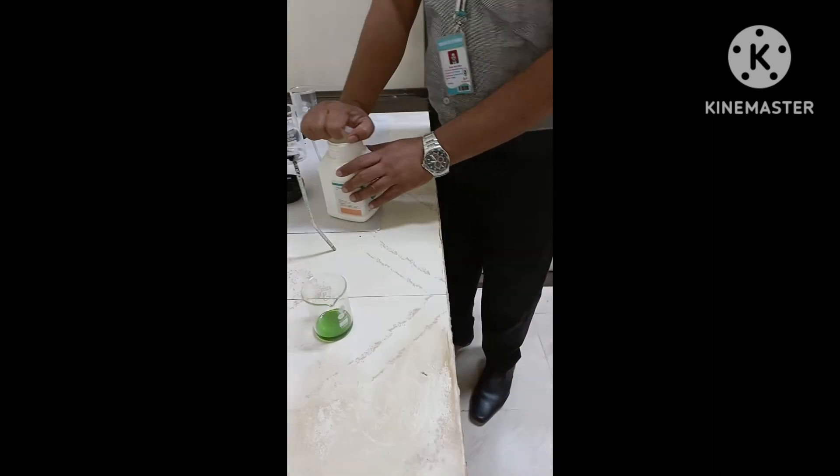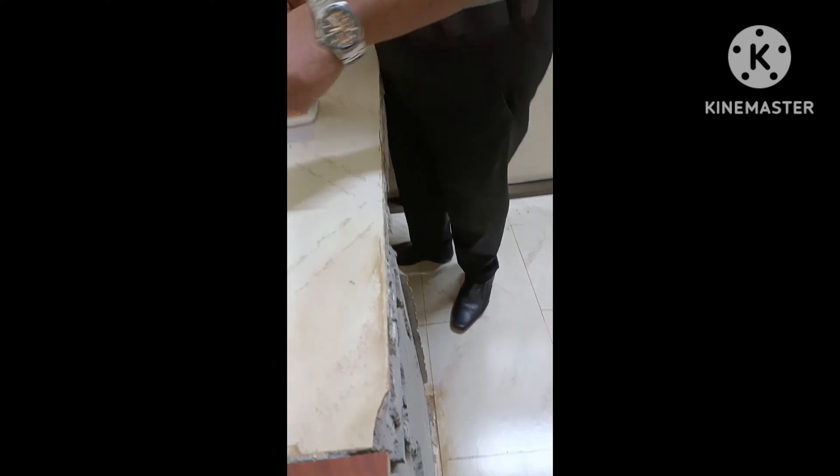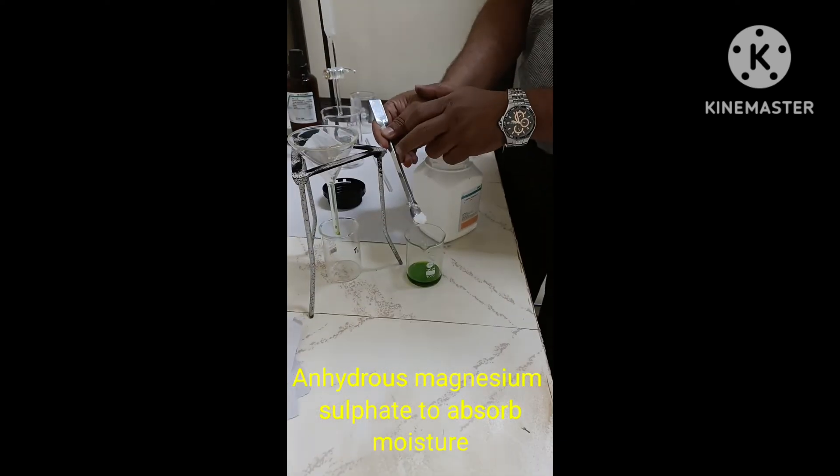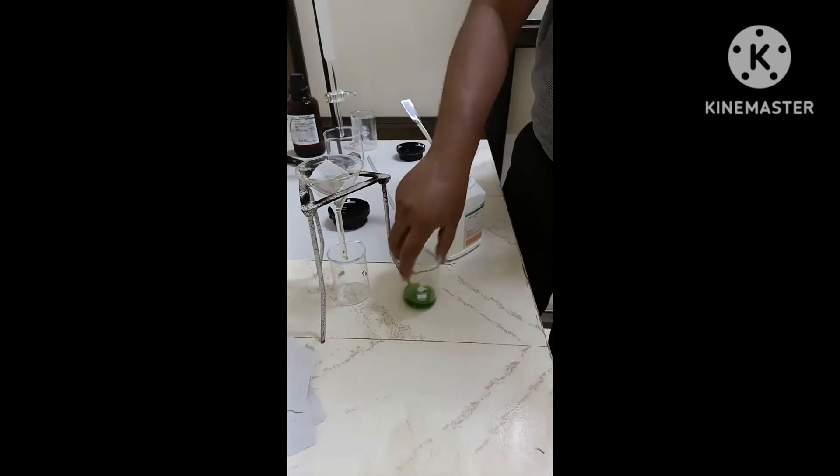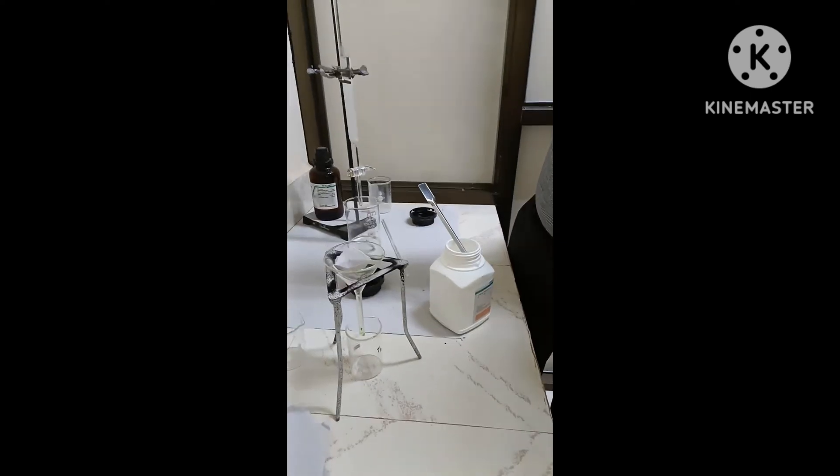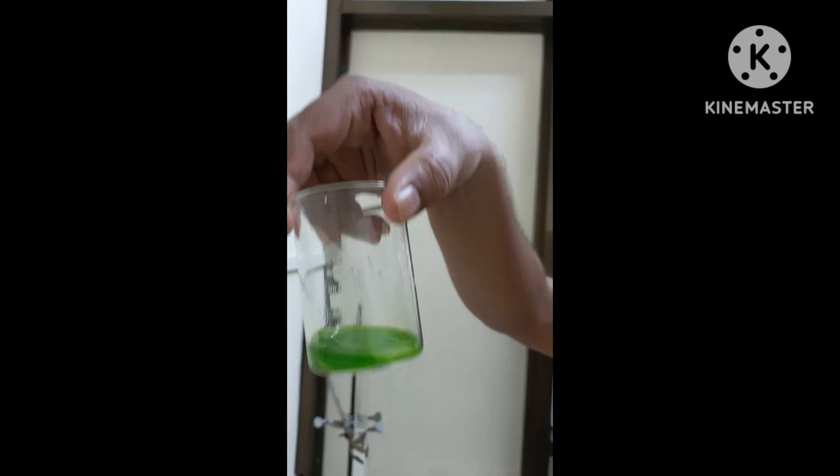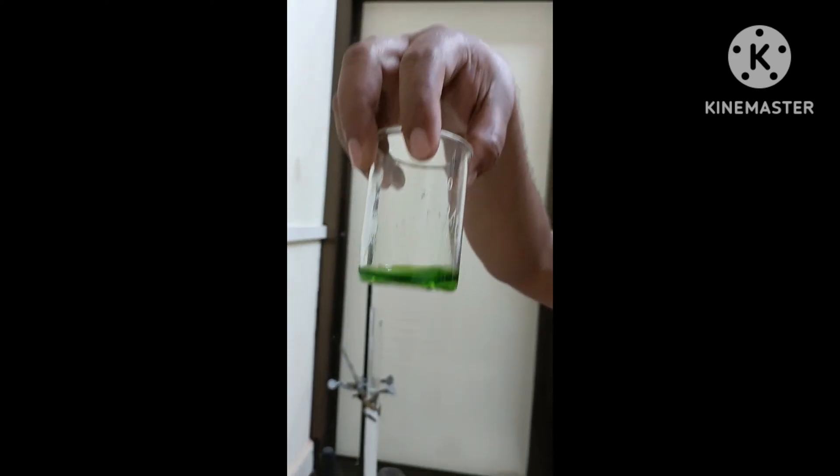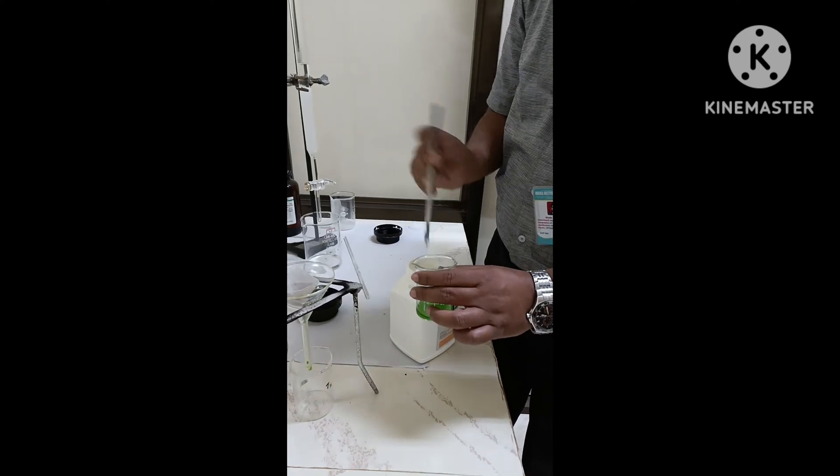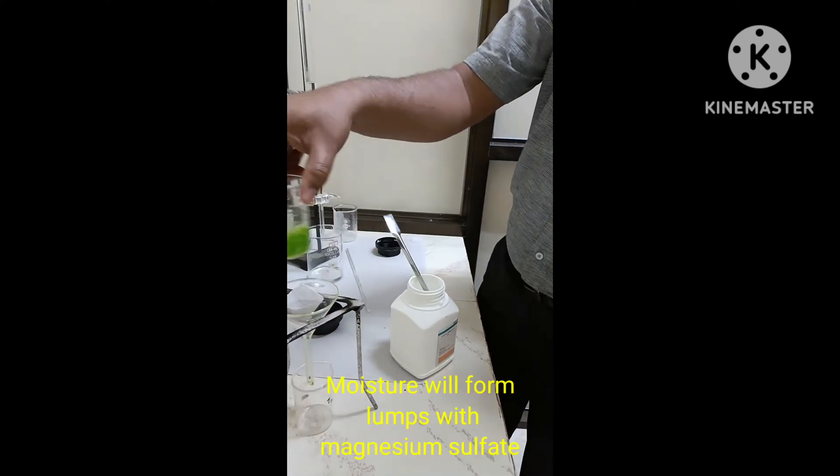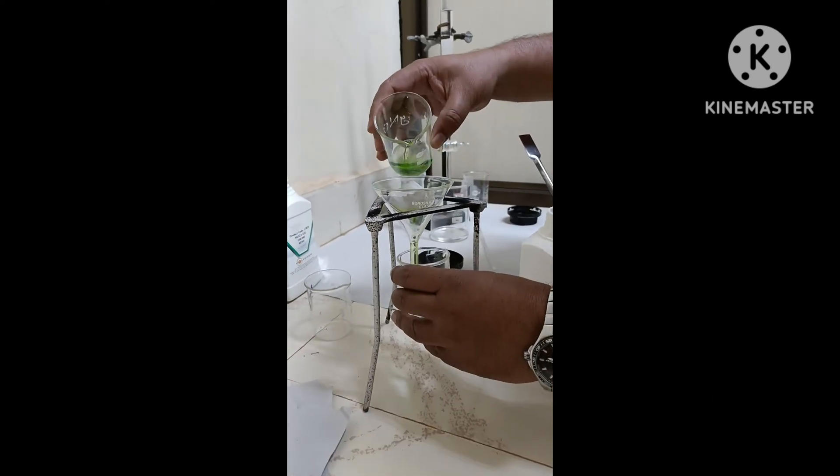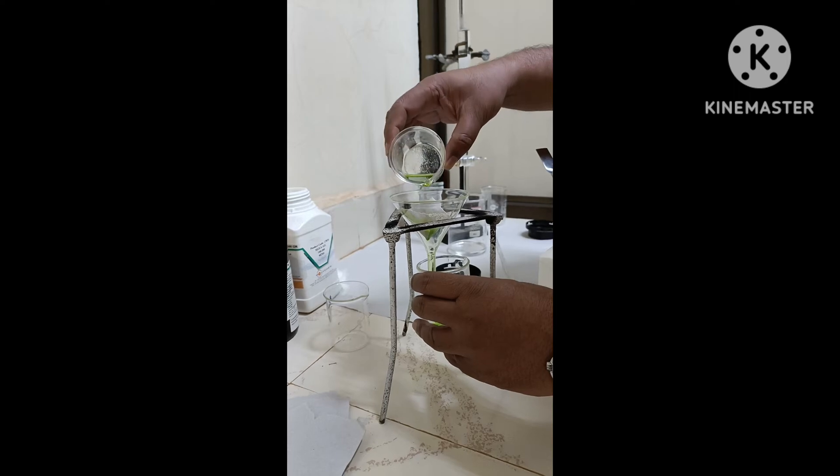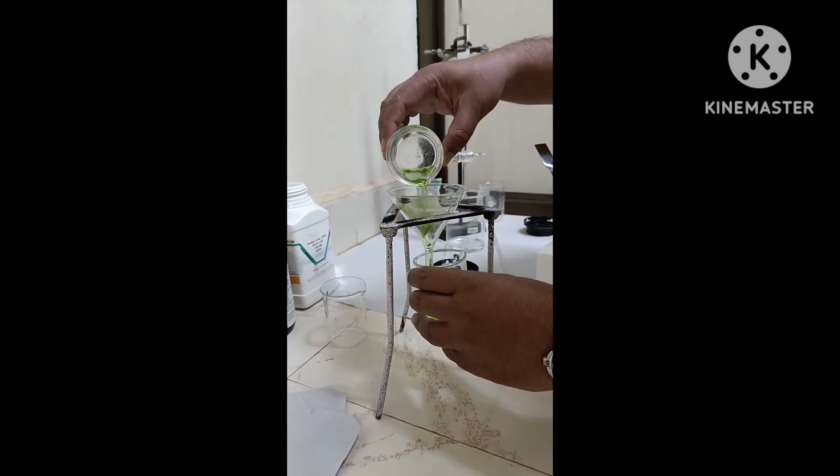Once we pack the column, next is we have to load the sample. Here our sample is the extract of spinach leaves. During the extraction, there is a possibility that it might have some moisture. To remove that moisture, what we are doing is adding magnesium sulfate, which is anhydrous. It will absorb the moisture and it will form lumps and then those we can filter out. What we will get is the pure extract and that we can load in the column.